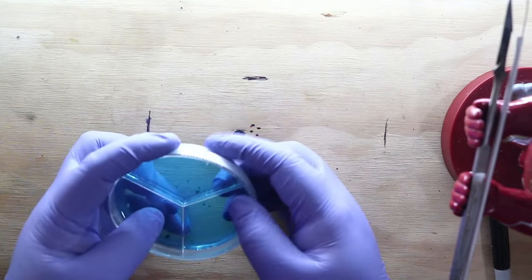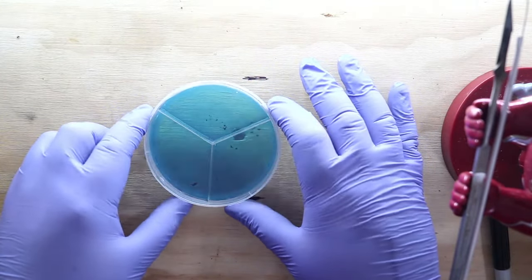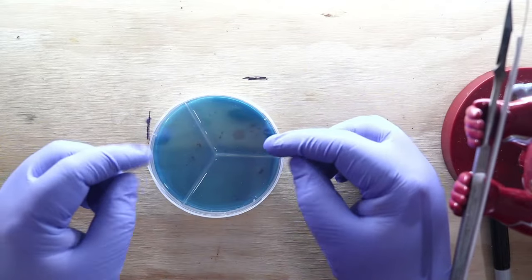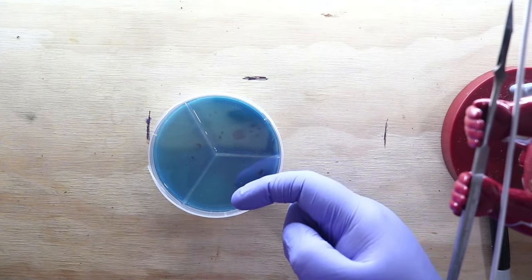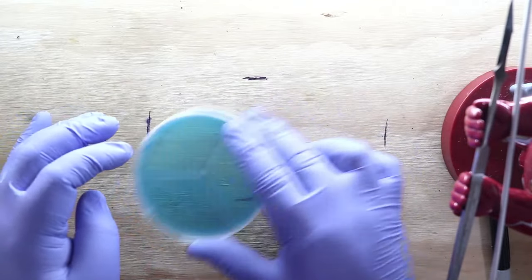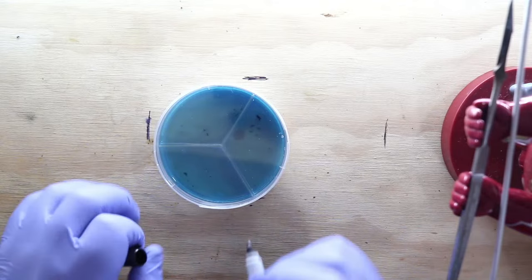So, sealed. You can probably see those little black flecks in there from the green elf cup. Now what you do is you just take it and gently shake it back and forth. You can get devices called a cell spreader, which look like a little hockey stick, and you can put them in there and spread your cells around. They're really quite unnecessary for the most part. Usually you'll know if you need one, but you just kind of roll it around a little bit. Done. And we'll take it and label it.